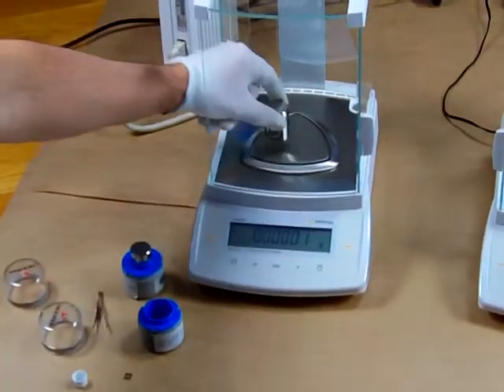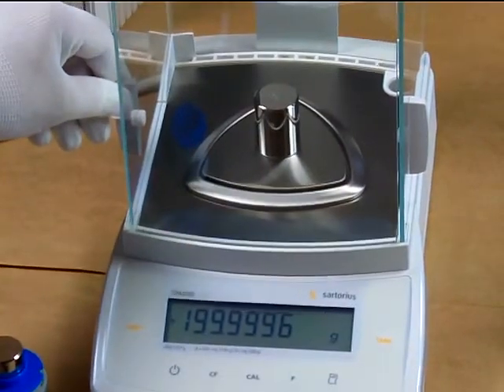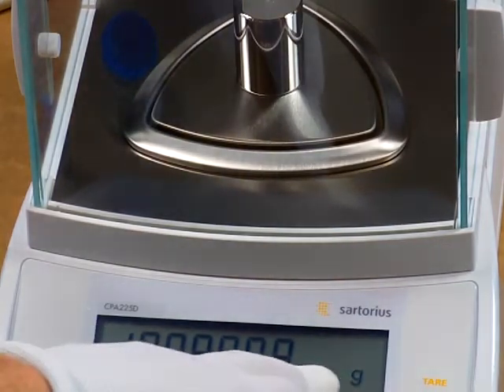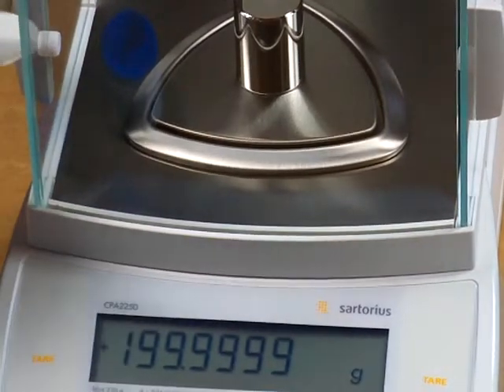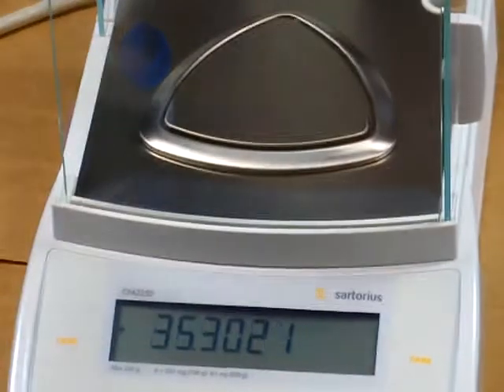We have here some class 1 calibration weights — a 200 gram ASTM class 1 weight. We'll put it on the balance. Notice the moment we go over 100 gram weighing capacity, the balance now changes to 4 decimal place. The specification on the CPA225D is from 0 to 100 grams by 5 decimal place. The moment we go over 100 grams, it drops to a 4 decimal place balance. There we have a 200 gram weight showing 199.9999.